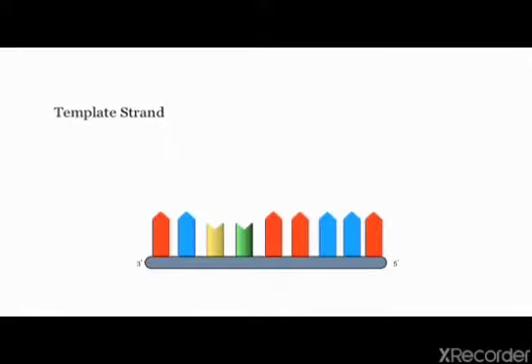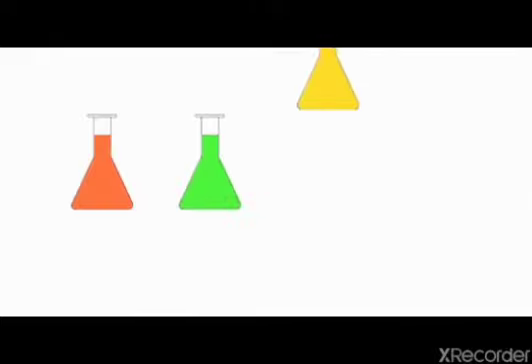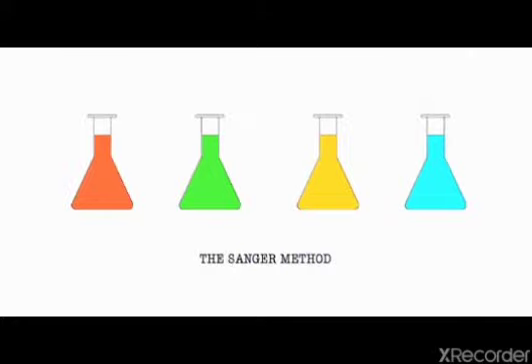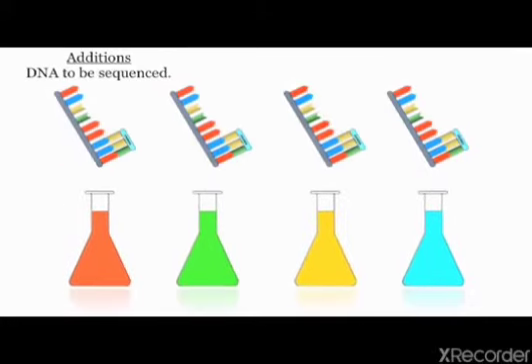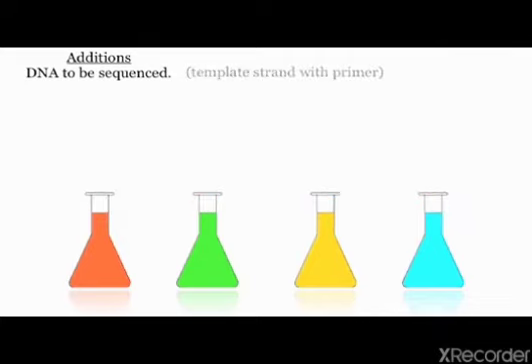A primer is then annealed to the template strand. This is to allow the addition of nucleotides later. Four reaction mixtures are set up. Added to each of these is the template strand of DNA with attached primer. This is the DNA that will be sequenced.